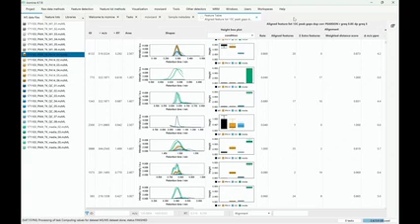When you upload the data into mzmine and you have a rectangle with an exclamation mark, what is the issue? Yeah, that rectangle is quite shocking to people. It's only a warning, and we try to warn you if we think there might be something wrong.